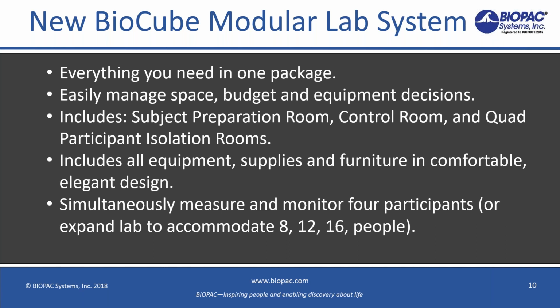This is sort of a little bit like flat pack furniture. It arrives in some rather large boxes. Someone from BIOPAC will come along and build the lab, and within 48 hours you have a fully functional lab that will allow you to collect data from 4 participants is the default setup, but you can add on quads to record from 8, 12 or 16 participants.